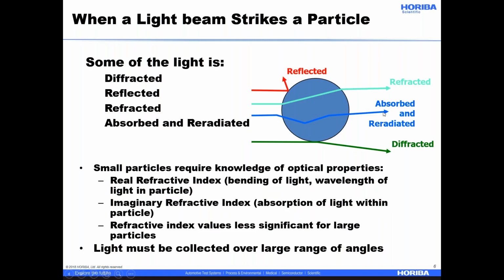But mostly we could think of that in terms of scattering, in terms of just the absorption, and then the diffraction for larger particles at the edges. So what this means is, depending on the size of the particle, these effects vary. And so if I can measure them, I can extract the particle size.